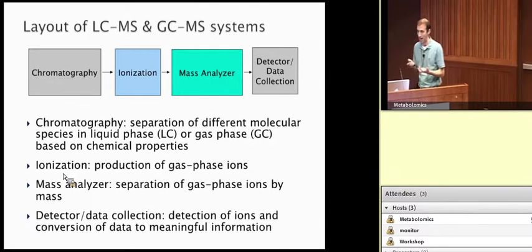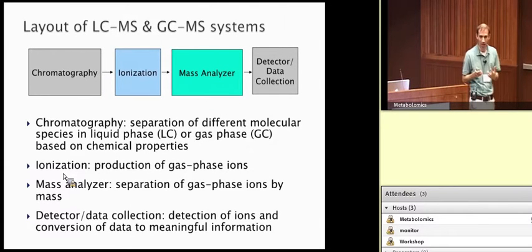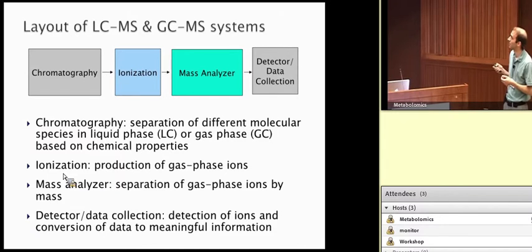So what do we do? We do combined, hyphenated techniques. So just a brief block diagram. This is something analytical chemists like to show a lot of how an instrument works at the basic level, and then they go off the deep end and start building crazy instruments. But this is good enough for right now.